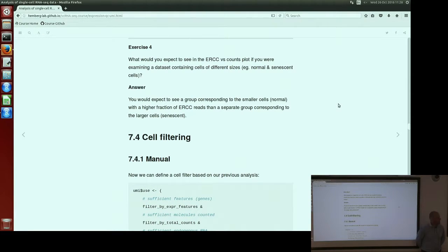In a word, no. I think typically people will run a pilot, potentially trying different ratios of ERCCs to endogenous RNA, to get to a point where they're happy with the ratio that they're getting. So to reiterate Tallulah's point about this distinction between using ERCCs for normalization versus using them for QC, you would have quite different targets in mind.